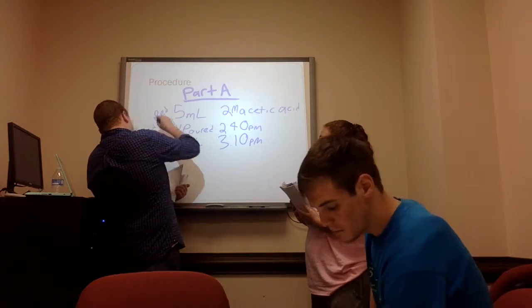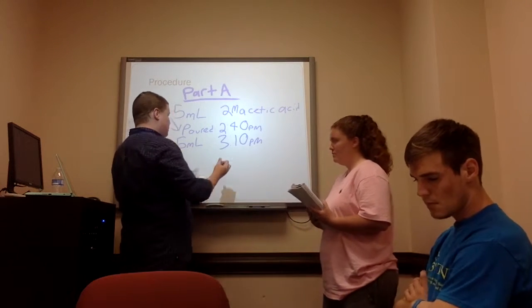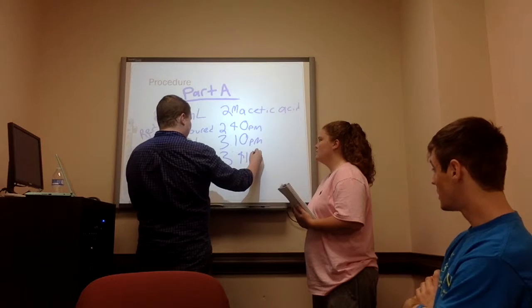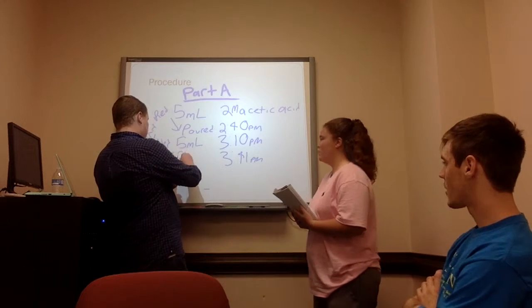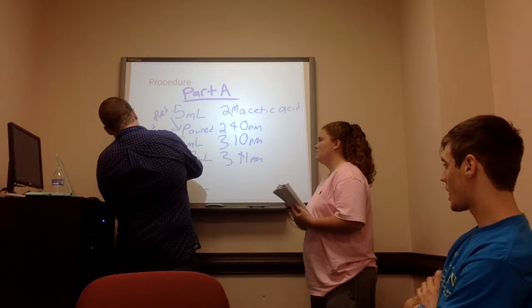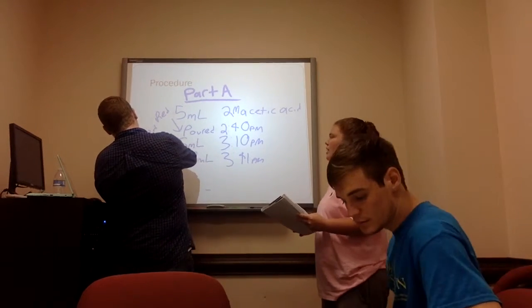So also red. And so you all waited another 31 minutes. You said that's awful specific. I don't know why anyone would get that specific. I'm just kidding. This is chemistry. We are specific. How much more did you add then? 2.7 milliliters. 2.7 more milliliters was added. Color still the same? Yeah, just diluted more.